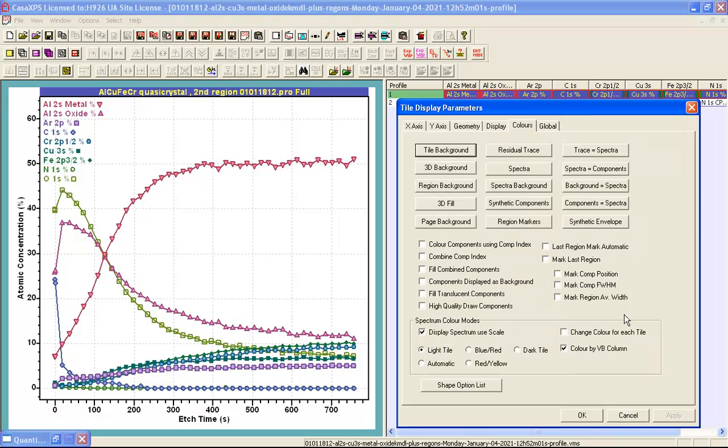There is another tick box on the colors property page that has an influence on how this depth profile is displayed. That is the color by VB column tick box is enabled.